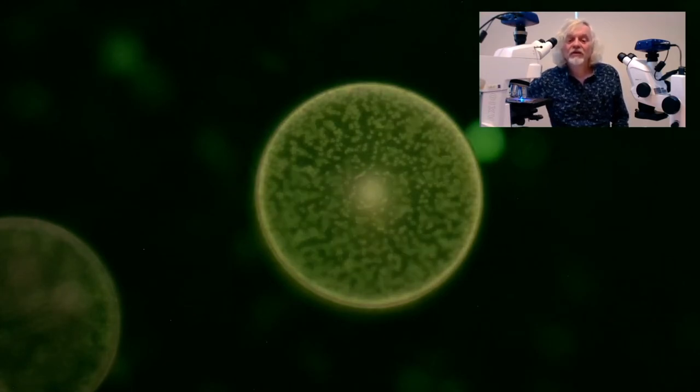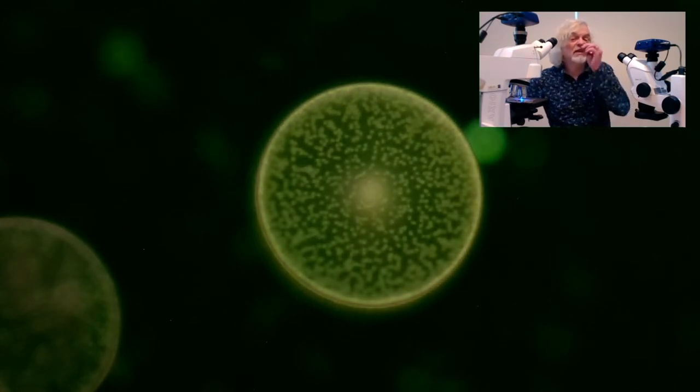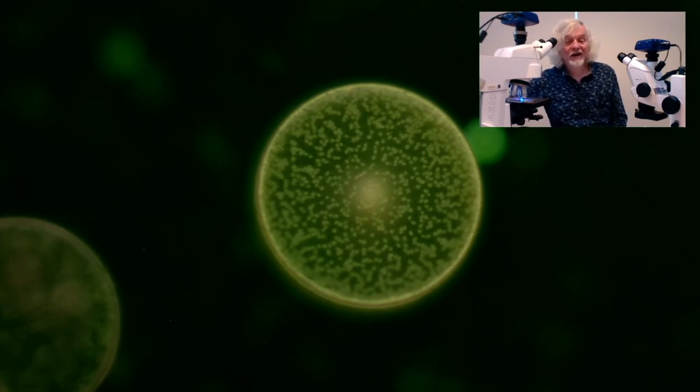The beautiful thing about this is we know those are chloroplasts because only they will show up in that color under this illumination.